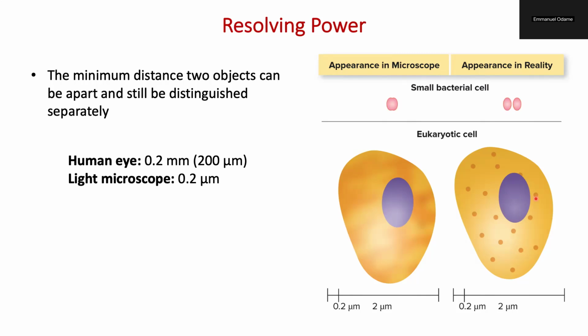As I was saying earlier, we have resolution power. Resolution power helps you make things clearer, as I was explaining from the previous slide.